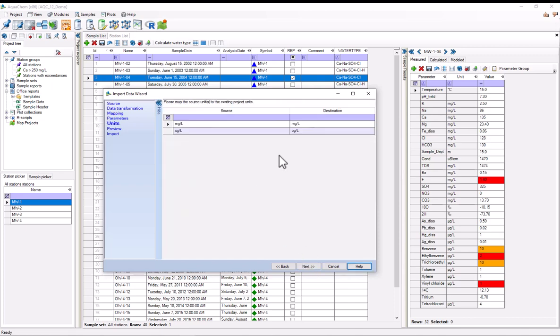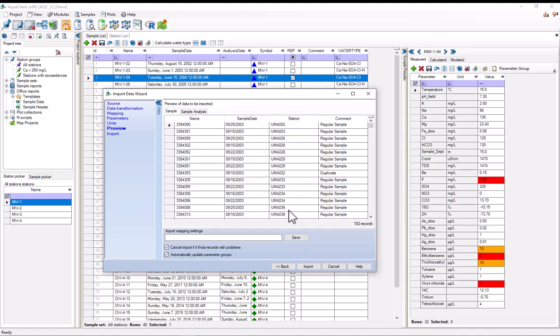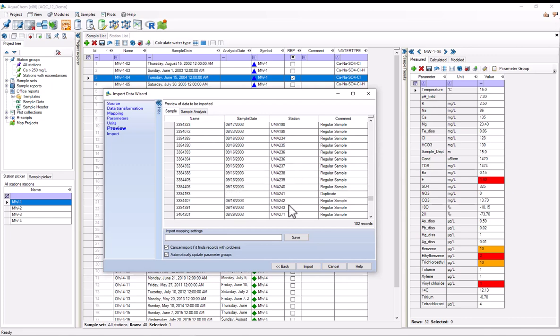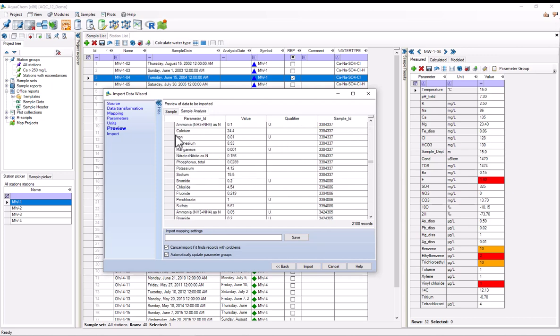And I'll move on to unit mapping. Here, the units exactly match the units in the database. So these were mapped automatically. So I'll just hit next. And now I'm just at the preview step. In the sample table, up here, we can see which samples will get added. You can also go to the sample analysis table and see every single sample that will get added.